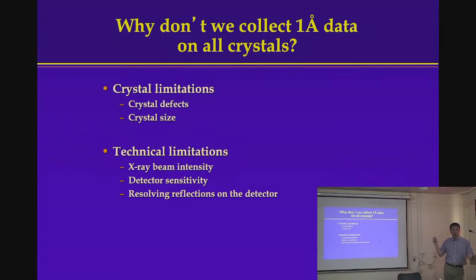Crystals, I guess you can say at the beginning when I show you crystals, to me it's always magical when I see a protein crystal. Because I don't have time to go through the math here, a protein crystal typically contains about a billion, a trillion molecules. And you saw the example. In the crystal, all the molecules need to be the same. So you're talking about a billion molecules, or maybe a trillion molecules lined up perfectly in the crystal. To me, that's magical. And of course, as you can imagine, it doesn't always happen perfectly.